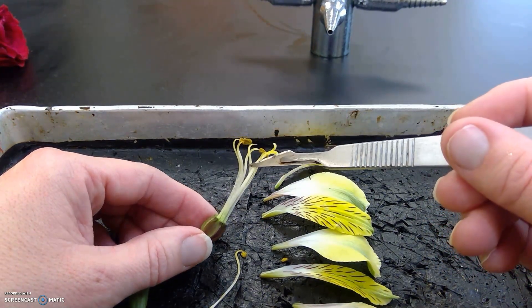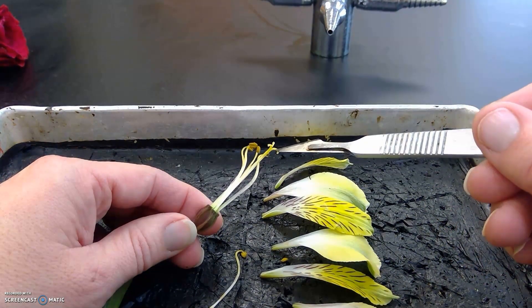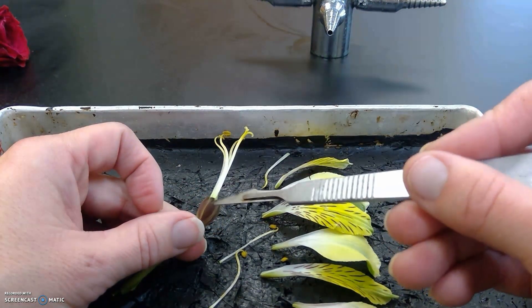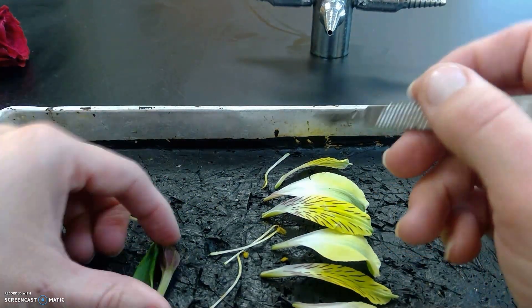Then we have the female portion, which is here in the middle. You can see she has the top, which is the stigma. She has the tube that goes down, which is the style. And then that goes down into the ovary. I'm going to try and cut that open so we can see into the ovary.